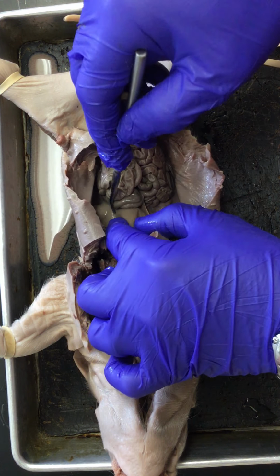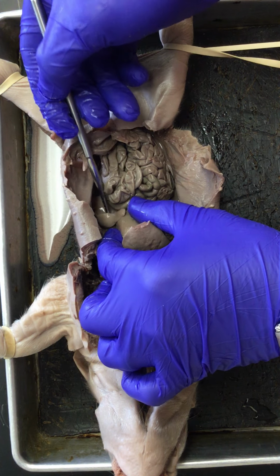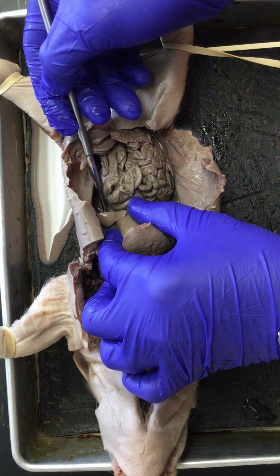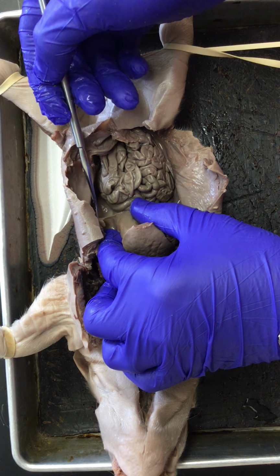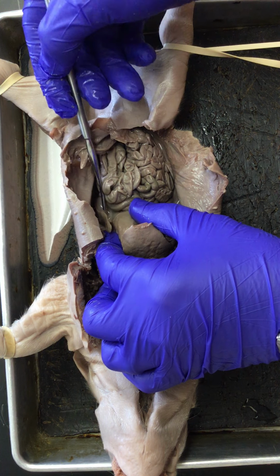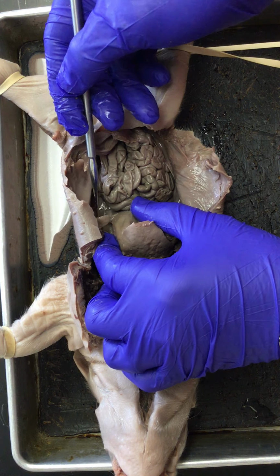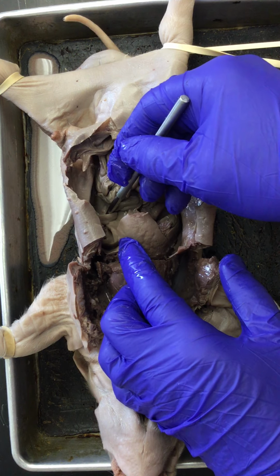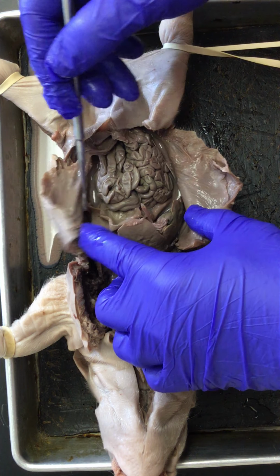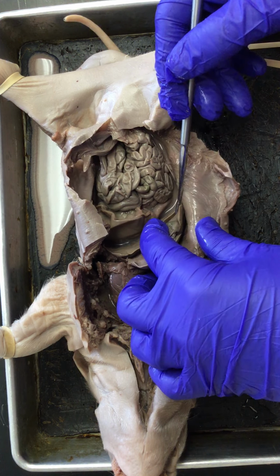Okay, underneath the stomach, there's a tiny little flap of an organ right here. This tiny little flap of the organ is this subject's spleen. So it's found just below the liver. Spleen is a filter for blood. A lot of the pathogens that this pig will get exposed to would get filtered out in this pig's spleen as the blood moves through it. So spleen, really valuable organ, especially in the immune system.